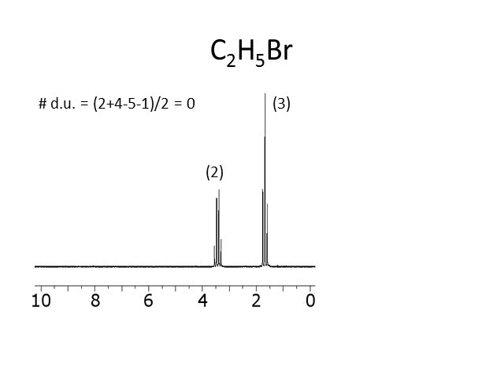I then go on to look at the chemical shift, because here I've got a proton NMR. I notice that this is the region for hydrogens attached to sp3 hybridized carbons. So I'd say somewhere between 0 and 4-ish are hydrogens attached to sp3 hybridized carbons. Except of these two, this one's more to the left, and so it must be near something more electronegative. Well, in my formula, I have a bromine. So this guy must be near bromine, and this one not so much.